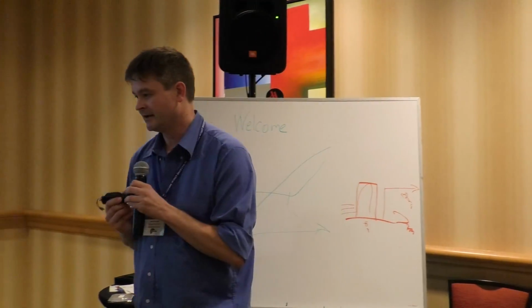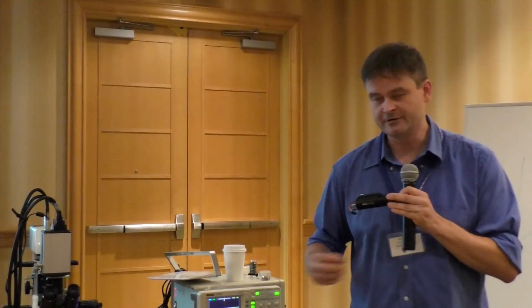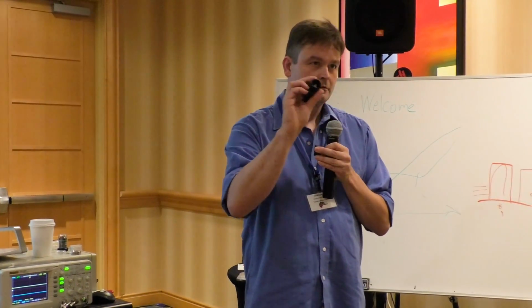So this is how it generates light, in a linear ramp. If anybody wants to see how linear it is on the power meter, please come by after the talk. Then the other part is where you have the sensors. Okay, so these are the two modes that it will produce for you.